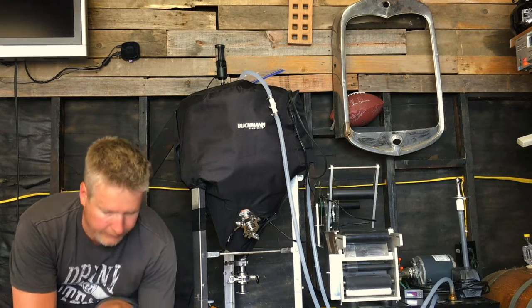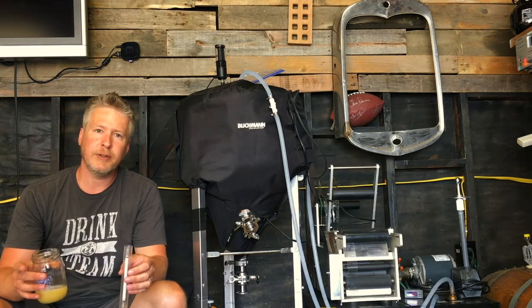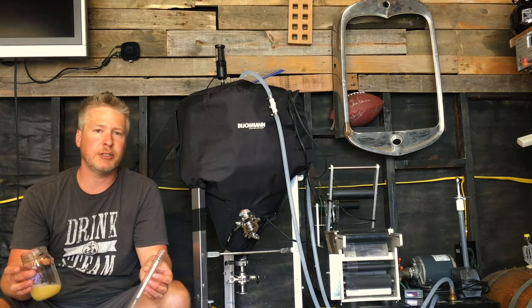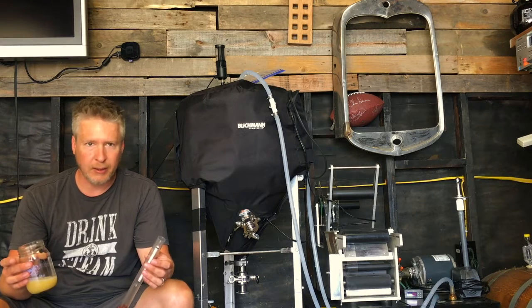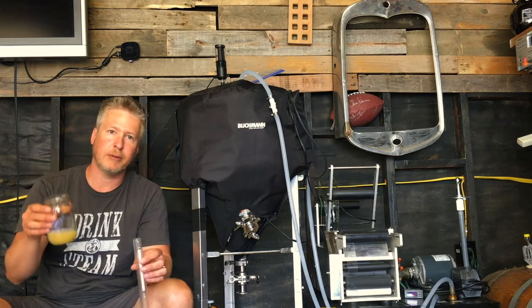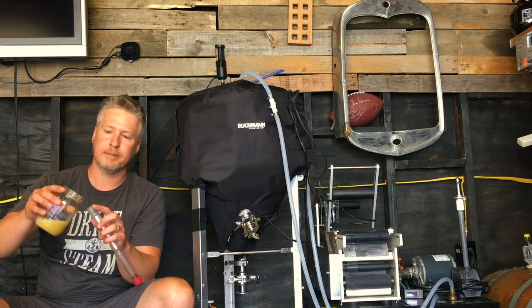Now we can get into our gravity. Just like before, one thing I didn't note is that if you are cleaning your glassware with Star San ahead of time, make sure it's dry. The reason being is Star San has a really low pH. Even in this small sample size, if we have a few drops in there, that'll skew our results. So just be aware of that.